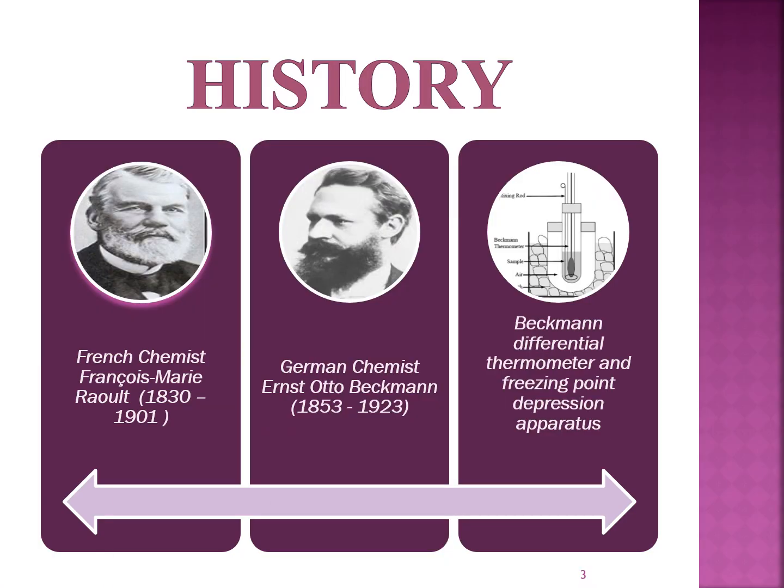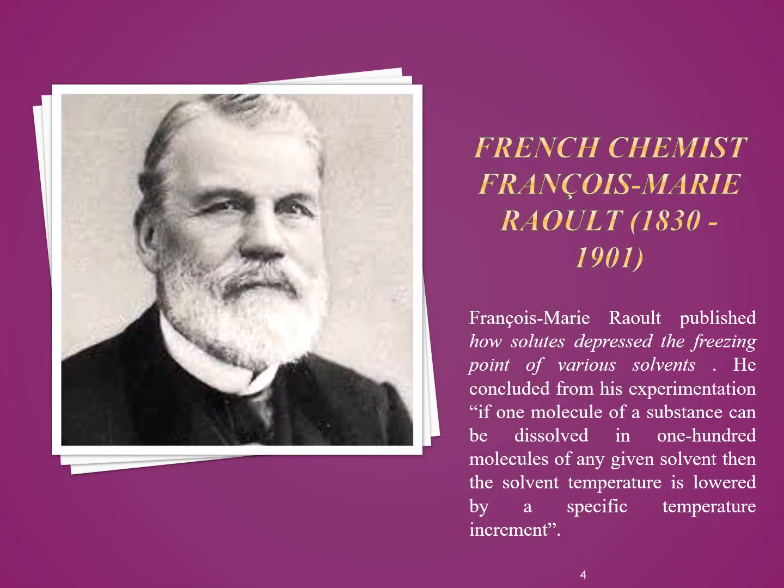Moving towards the short history, French chemist Francois-Marie Raoult and German chemist Ernst Otto Beckmann invented the Beckmann differential thermometer and freezing point depression apparatus. Francois-Marie Raoult published how solute depresses the freezing point of various solvents.